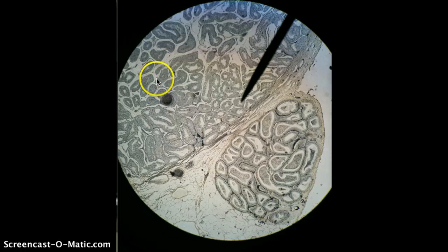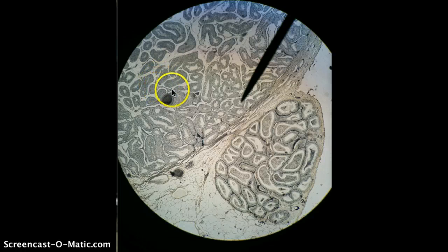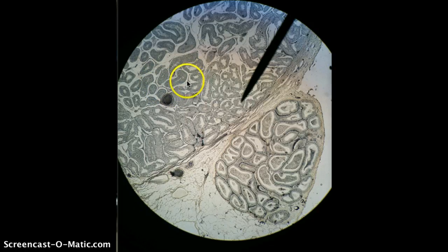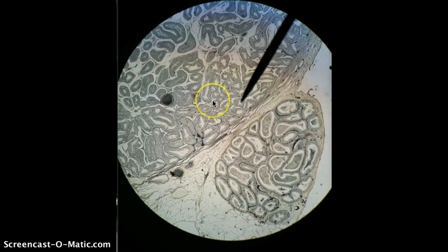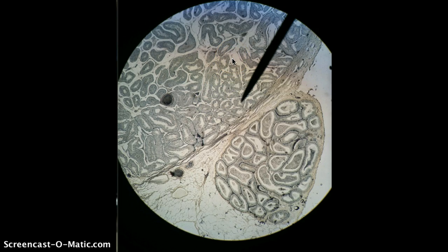So in the testicle, we have these little triangular cells here, which are the interstitial cells. What do the cells secrete? Testosterone. And what stimulates the interstitial cells to secrete testosterone is LH.